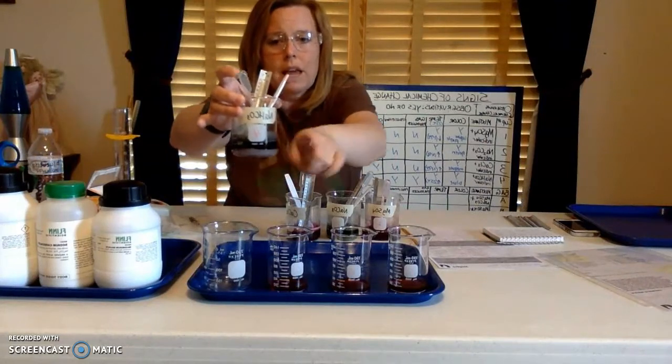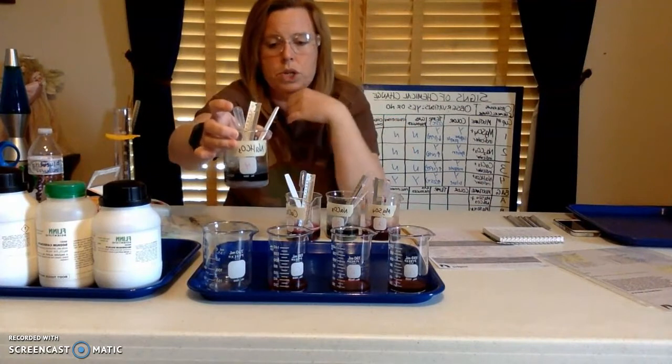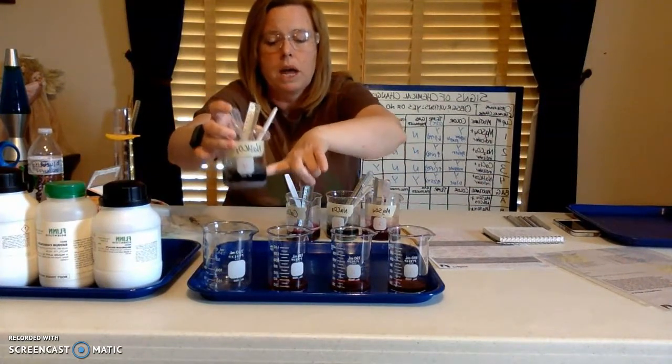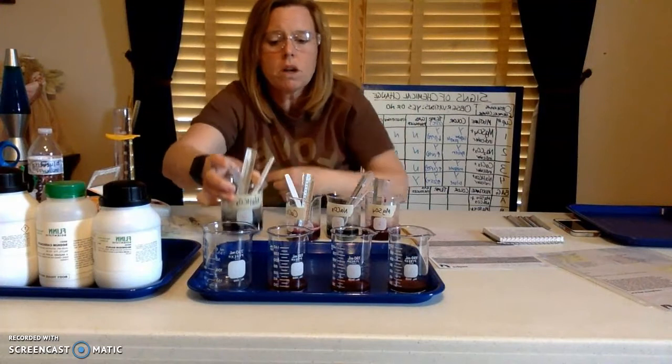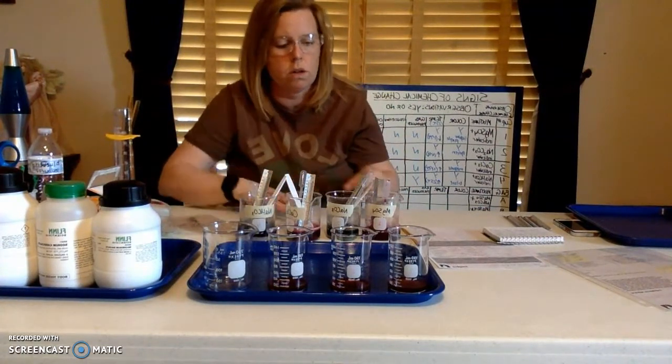So this one definitely had a lot of bubbles. You can see the residue, hopefully. A lot of bubbles, which is another characteristic of a chemical reaction. But we also got a separation. In our world, in 6th grade science, we're going to call that a precipitate because that's pretty darn close.